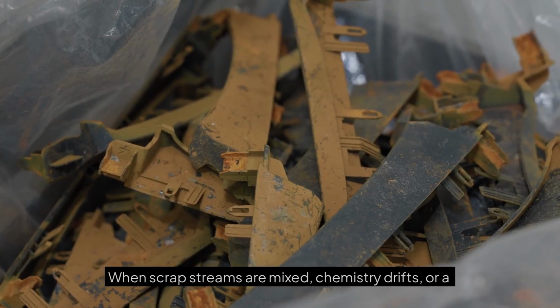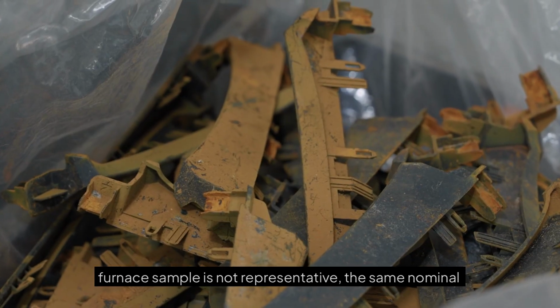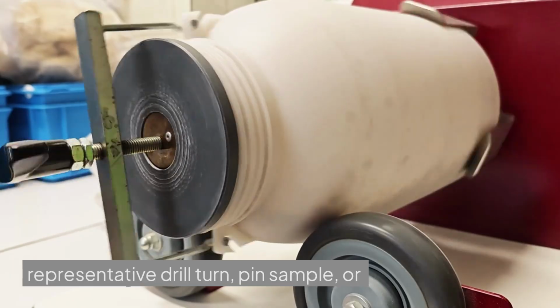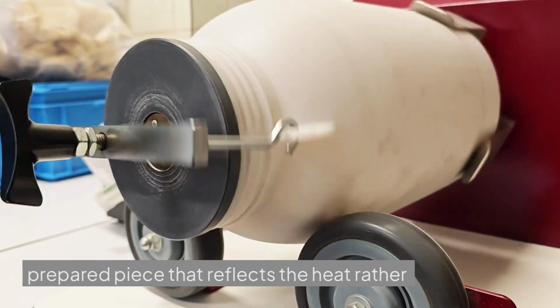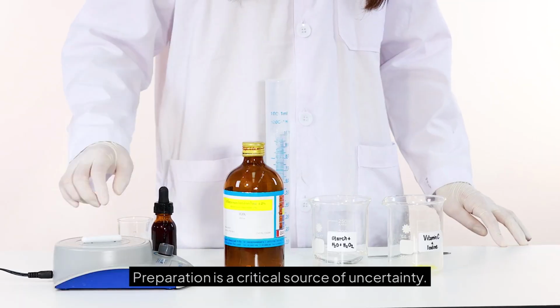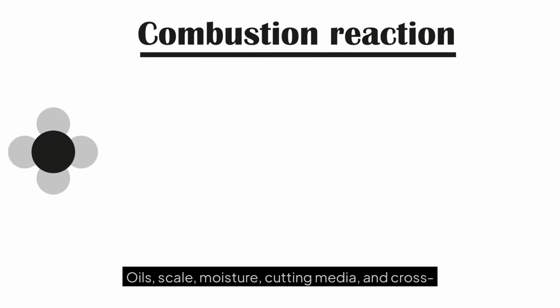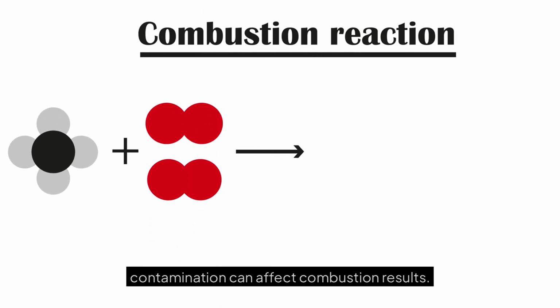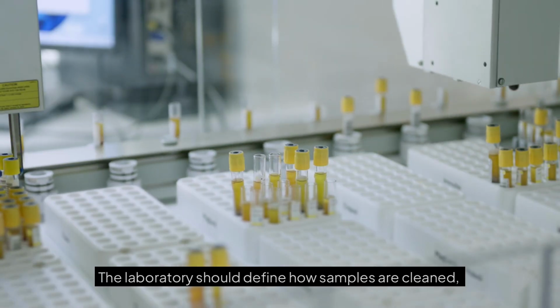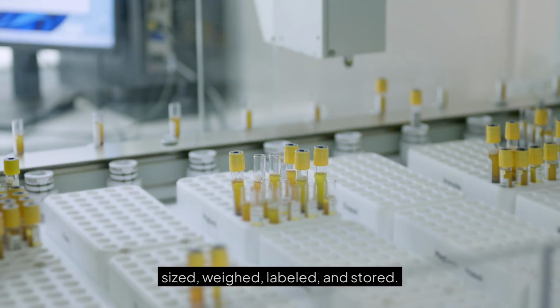When scrap streams are mixed, chemistry drifts, or a furnace sample is not representative, the same nominal alloy can behave differently. Reliable control begins with a representative drill turn, pin sample, or prepared piece that reflects the heat rather than a segregated surface. Preparation is a critical source of uncertainty. Oils, scale, moisture, cutting media, and cross-contamination can affect combustion results. The laboratory should define how samples are cleaned, sized, weighed, labeled, and stored.